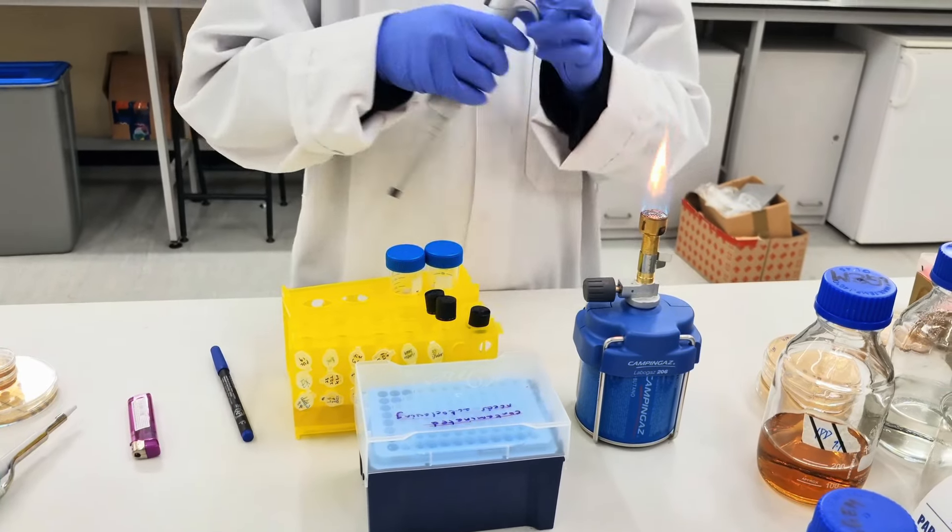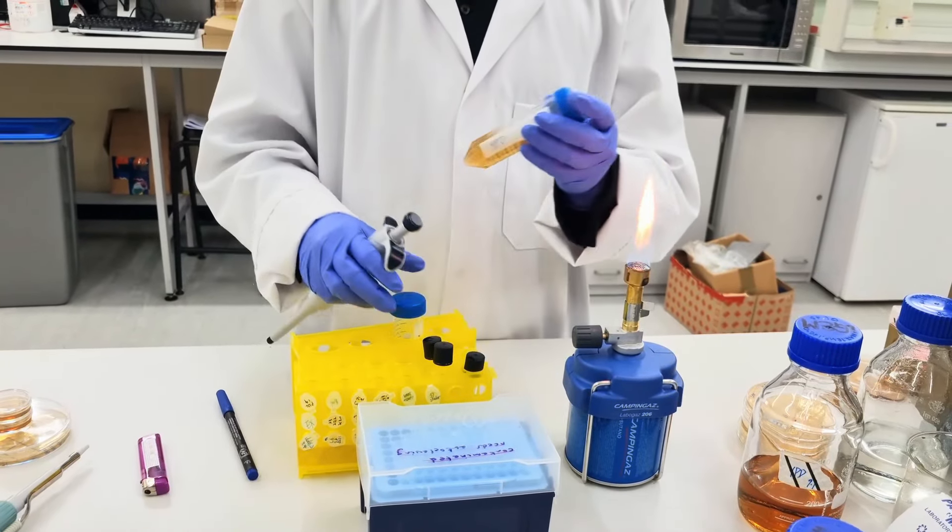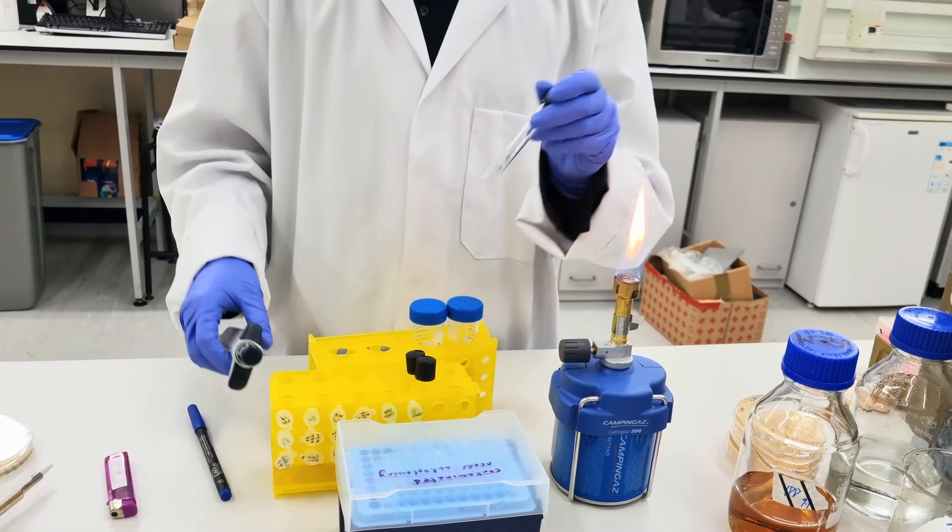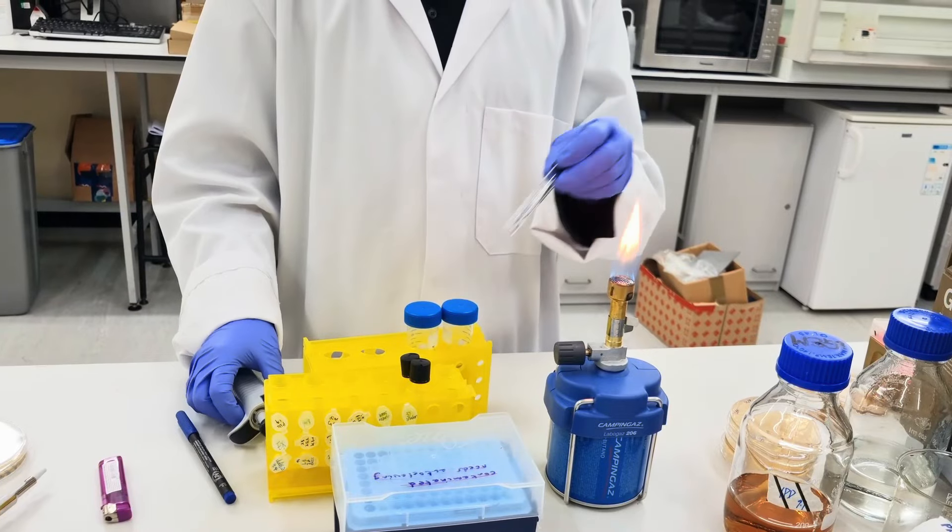The next step is to take some medium from your falcon tubes and transfer them into your culture tubes. Usually for one liquid inoculation we do three mils.